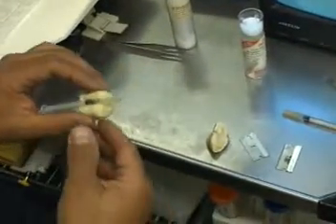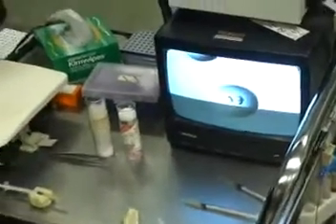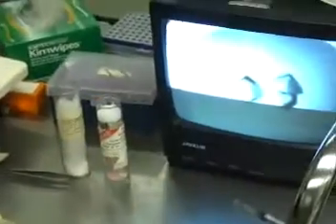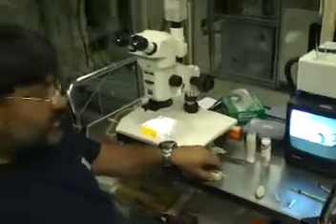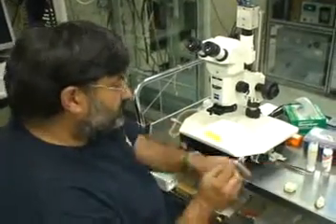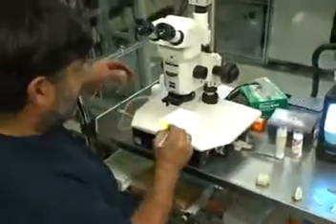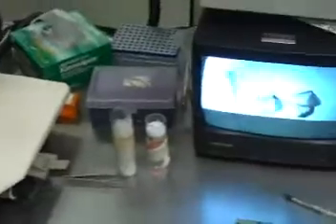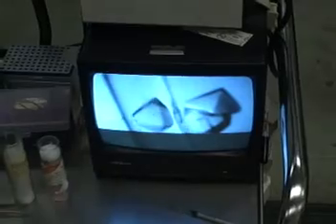Now we are ready to fish the crystal, so maybe you want to look at the crystal here in the microscope. That's a crystal with a drop of water and we are going to try to fish one of these crystals into the capillary. I put the capillary close to the microscope to see if it has the right size — right now you can see the capillary is about the right size, maybe it's too small. That's the width of the capillary and that's the size of the crystal.